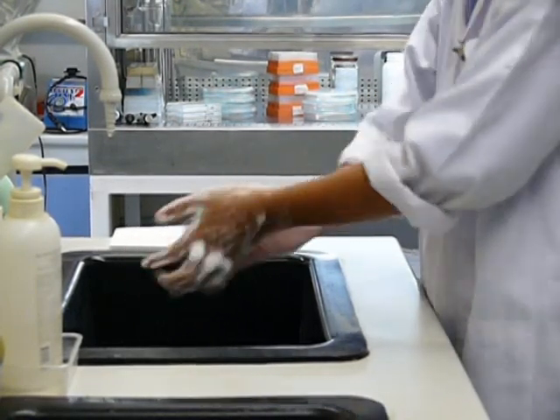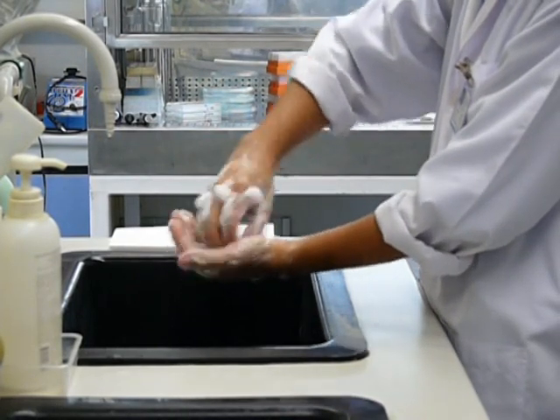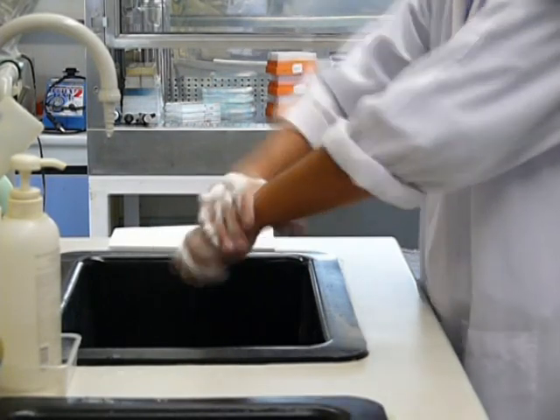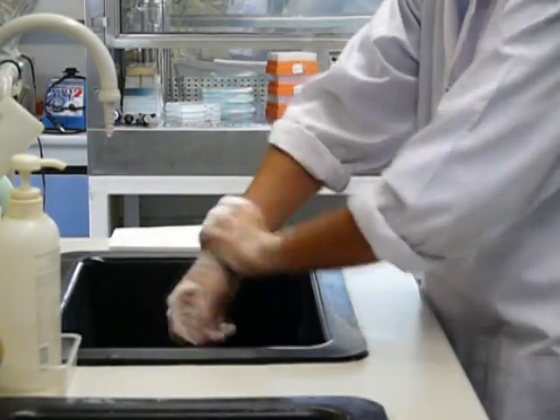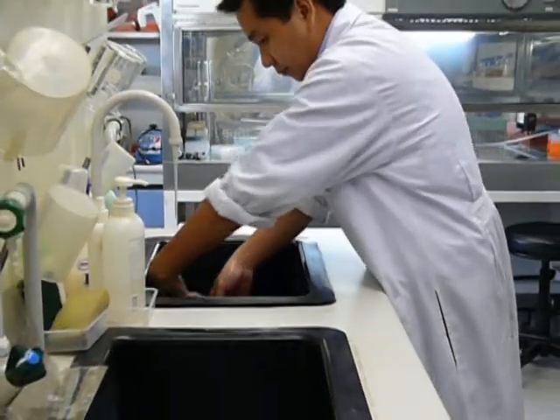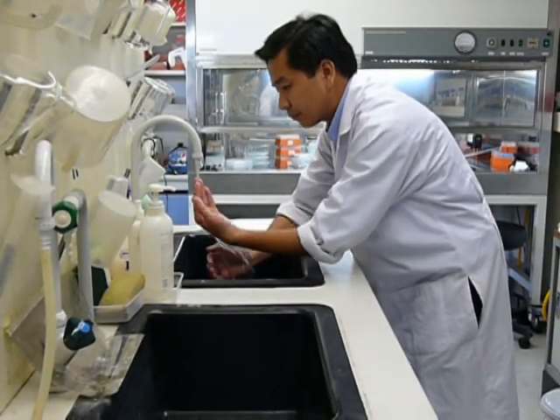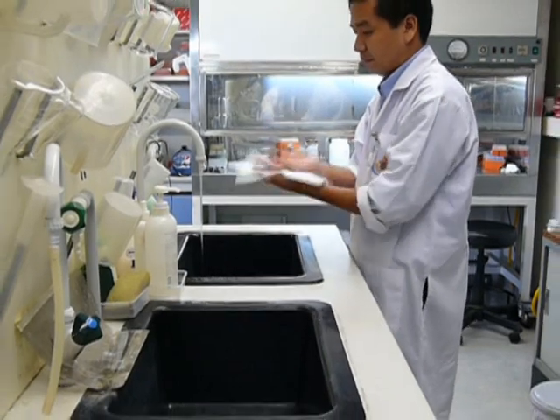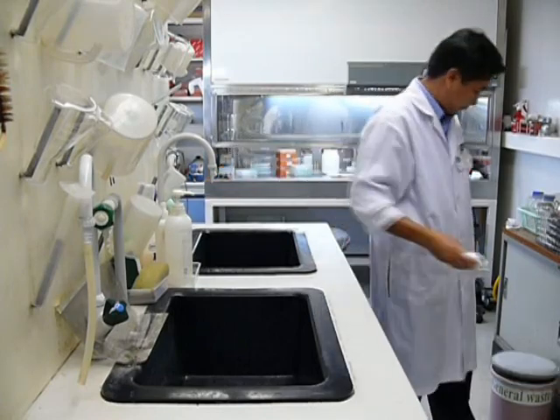Use of liquid soap is generally preferable to bar soap. 20 seconds of vigorous lathering will remove most contamination very effectively. After drying your hands with a paper towel, you can use the towel to turn off the faucet and thus avoid recontaminating your hands.